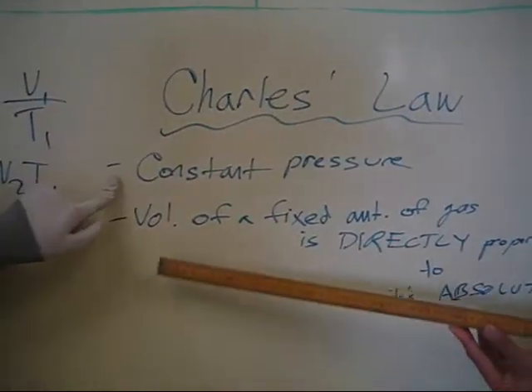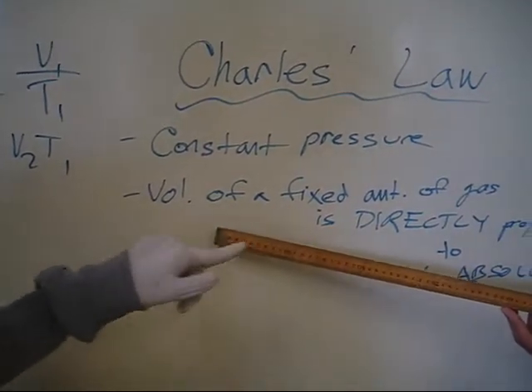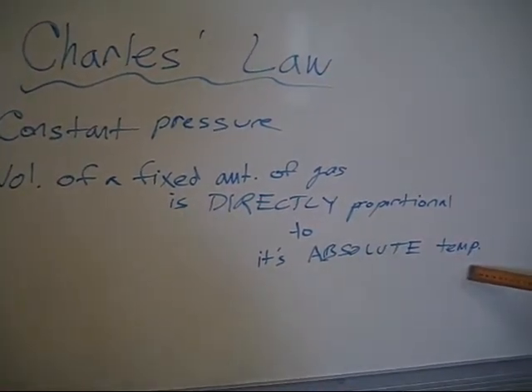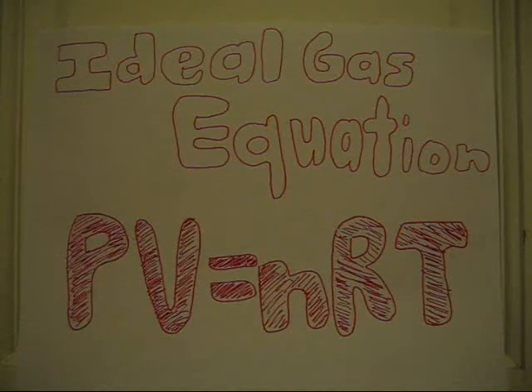So we were able to still keep the flask at constant pressure, or beaker, I apologize. And you can see that the volume of the soap is a fixed amount of gas, or in this case, a fixed amount of the air particles inside the soap, and it expanded directly proportional to the absolute temperature.